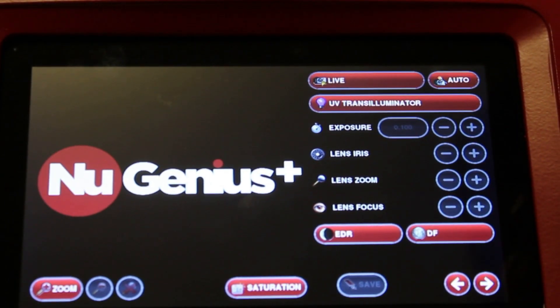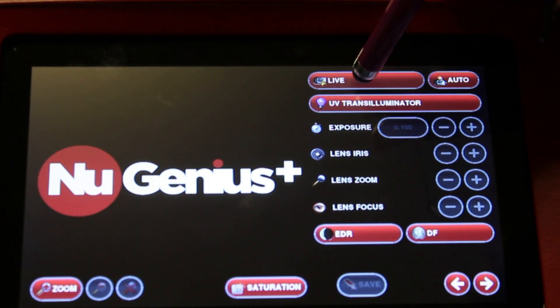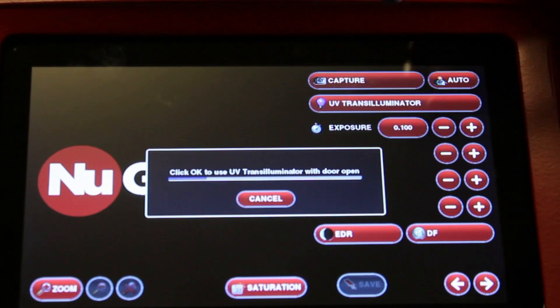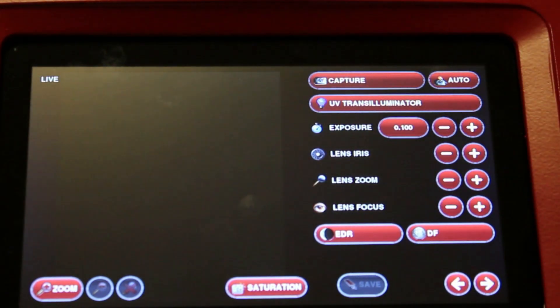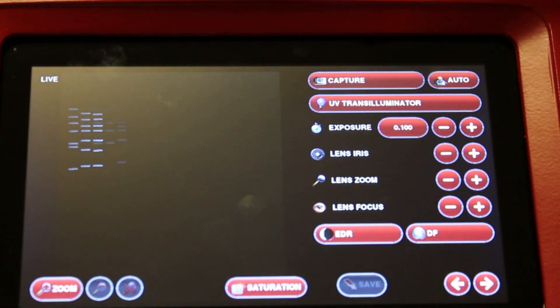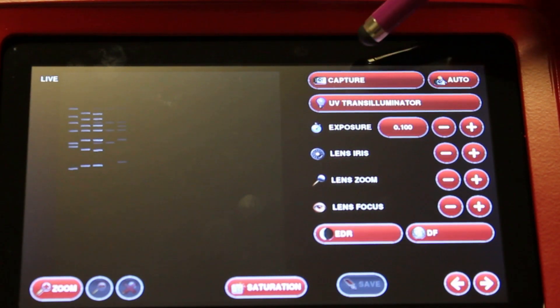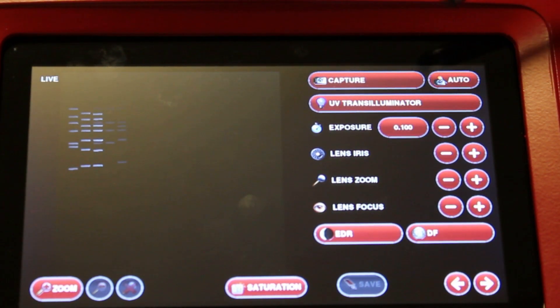This is your home screen, so to get a live image press the live button here. Once you have a live image, your button then changes to your capture button.